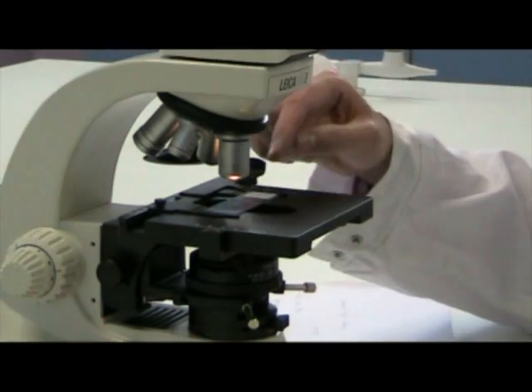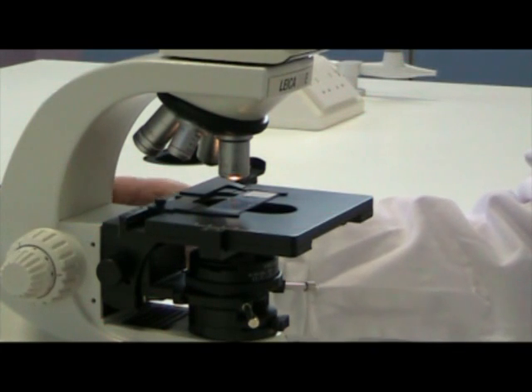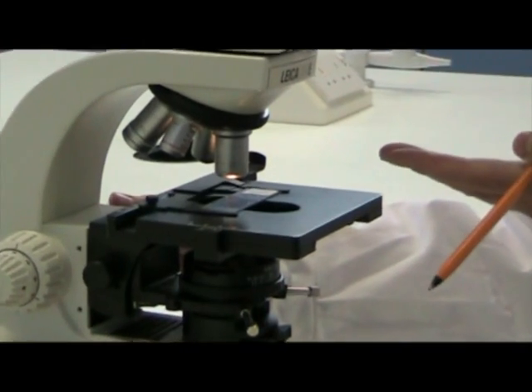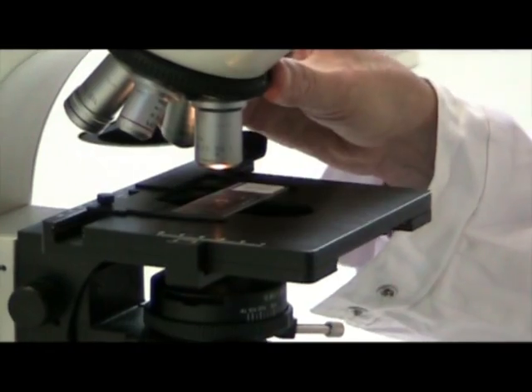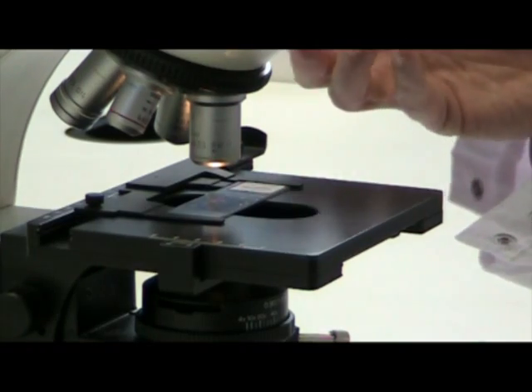Finally, be very careful when you focus the specimen on the stage. As you focus the specimen, the stage rises up. So be very careful if you have a large objective lens in there that you don't raise the stage so much that you crack the specimen.